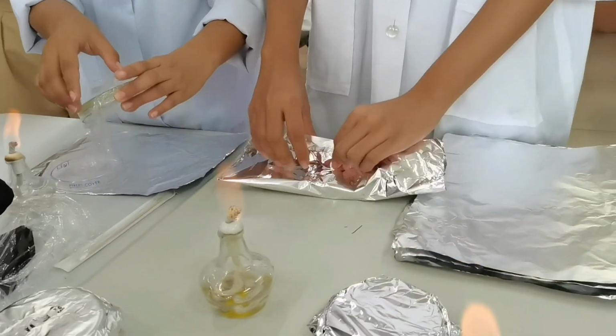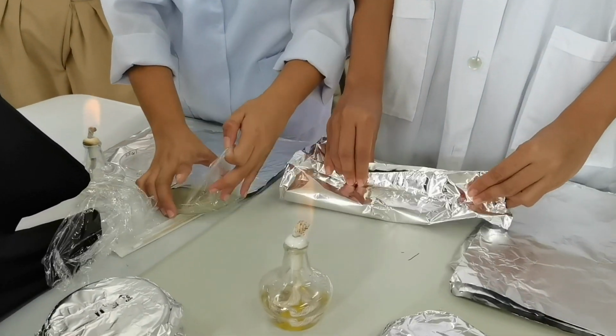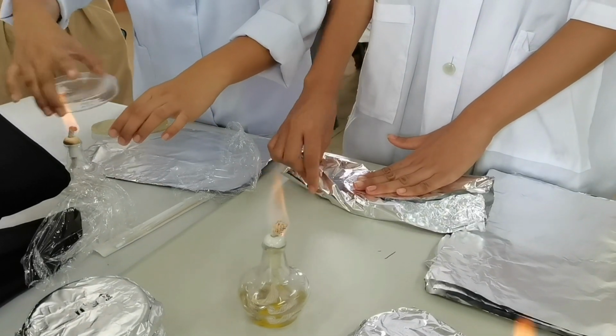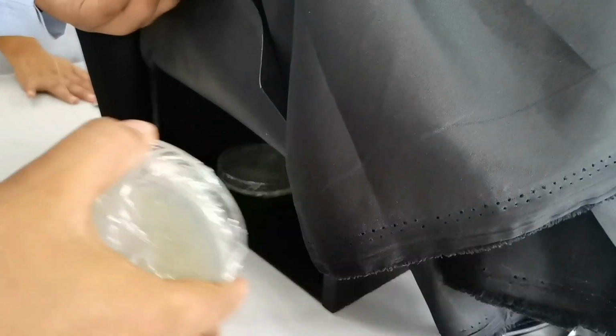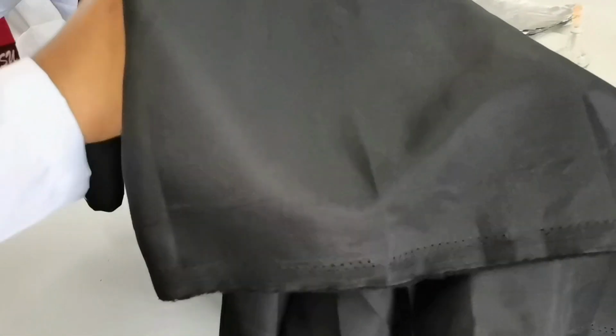So we want to test here whether there is a photo repair system. At the same time, we want to find out to what extent the time of exposure to UV affects the growth of the test organism.